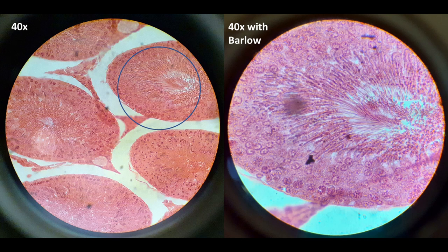Very high magnifications are not very meaningful, but why not try it? Barlows are quite cheap and if you're satisfied with them, simply give them a try. The best way still is to buy dedicated eyepieces and not expect any miracles — the resolution is determined by the objective and every optical element you add in the light path will only decrease image quality. But as you can see in this case the decrease in image quality is not that high, and it might be a feasible solution. I wish you all the best, happy microbe hunting as always. If you like the information in this video please consider subscribing, check out my website and my other YouTube channel, and see you around next time. Bye bye.